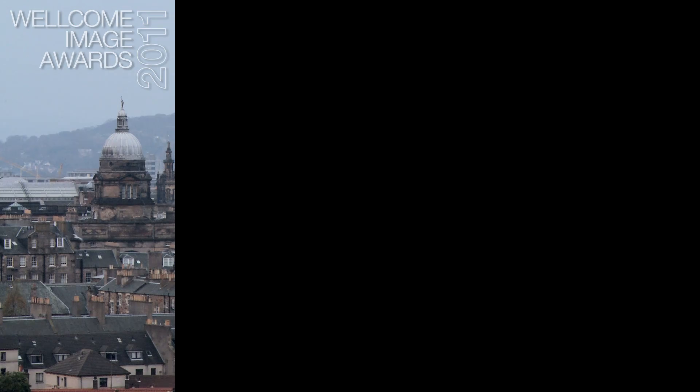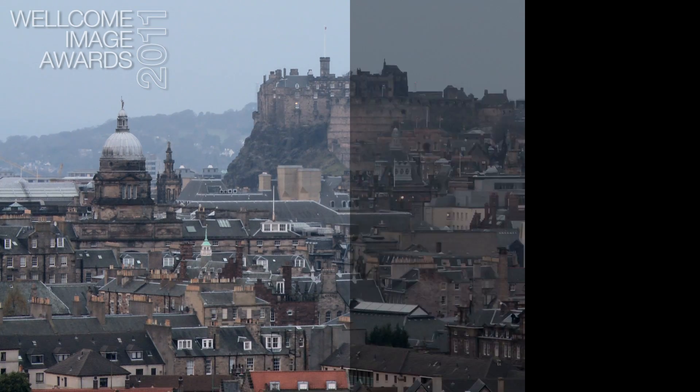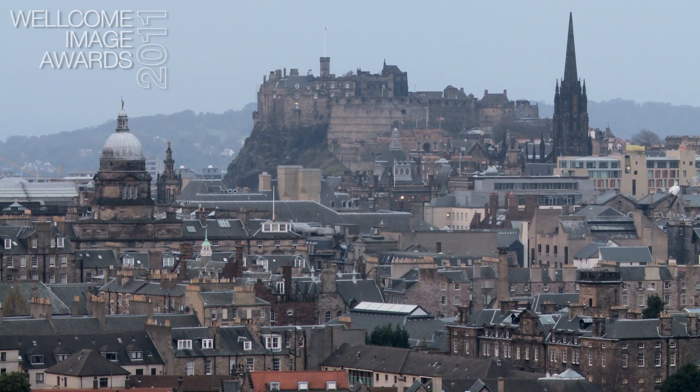OPT stands for optical projection tomography. The word tomography itself simply comes from the Greek of tomo, meaning a cut or a slice.